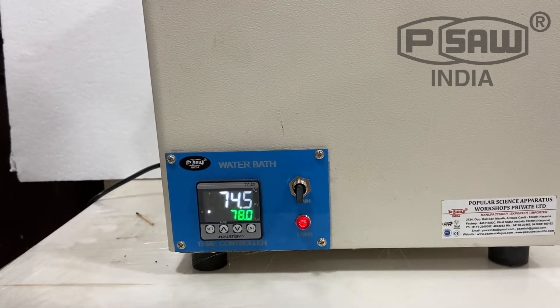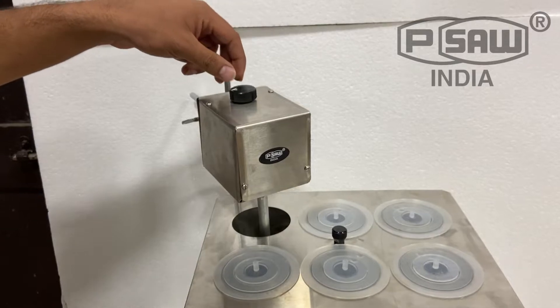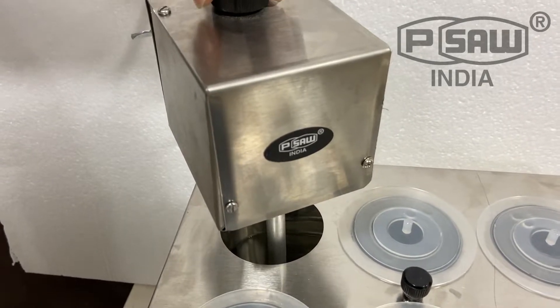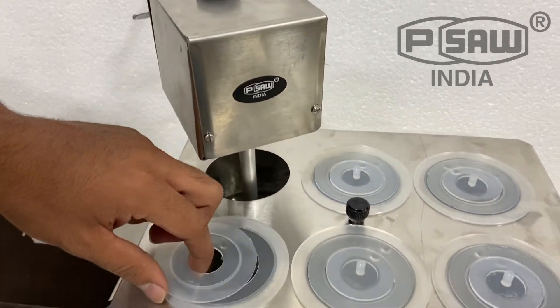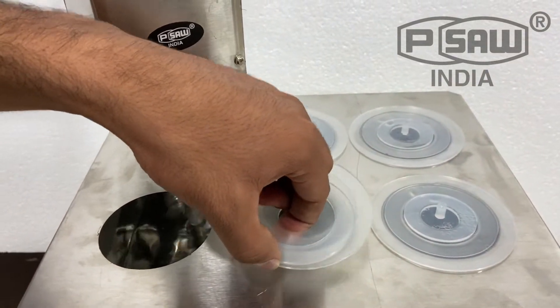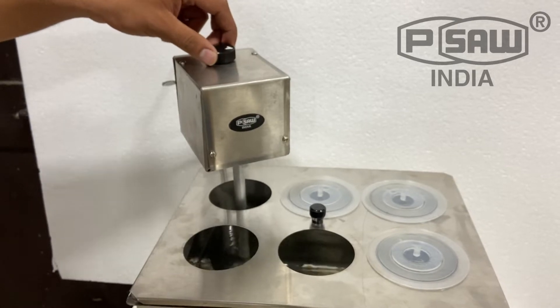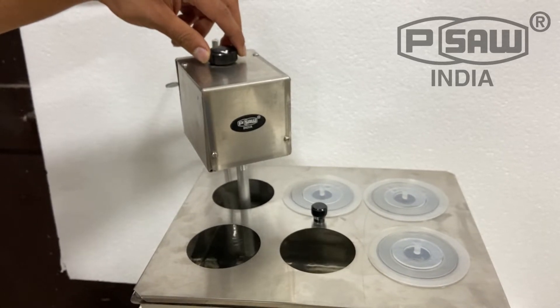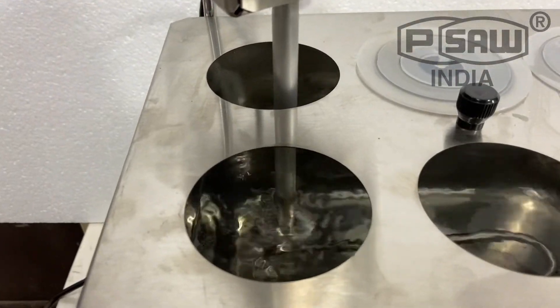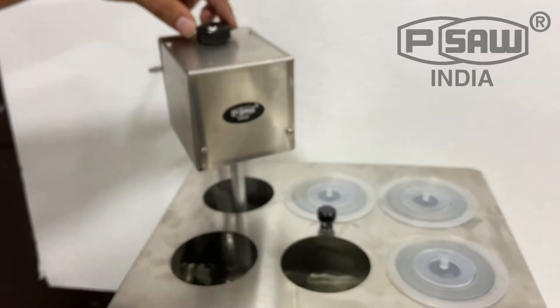It will start working. It has six holes. For the circulating pump, rotate the knob — you can set the desired RPM. The water will start circulating; you can set the rotation speed through this knob.